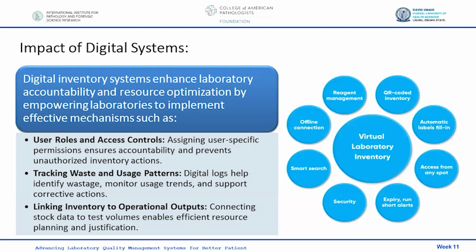So the advantage of this digital system is that it enables the lab to assign user specific permissions, and this engenders accountability and prevents unauthorized inventory actions. It can also help in tracking waste and usage patterns. These digital logs help to identify wastage, monitor usage trends, and support corrective actions.